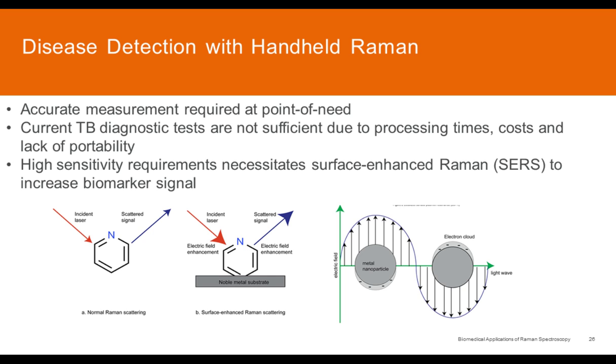So surface enhanced Raman, or SERS, is a variation of Raman spectroscopy, but instead of our normal sampling setup that we have on the lower left side of the screen, we adsorb our sample to some sort of metal nano substrate, which is usually fabricated from either gold or silver. The enhancement that we see here results from the amplification of light by the excitation of what's known as a localized surface plasmon resonance, or LSPR.